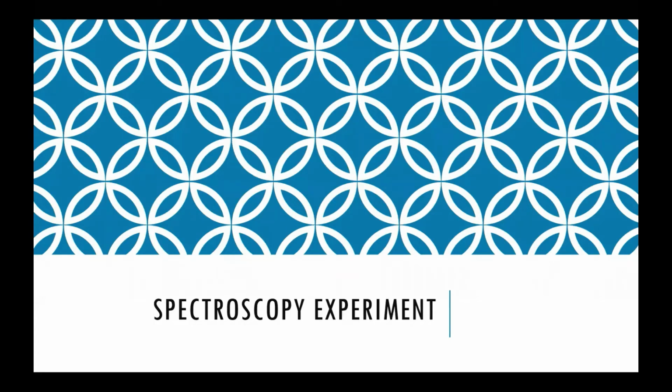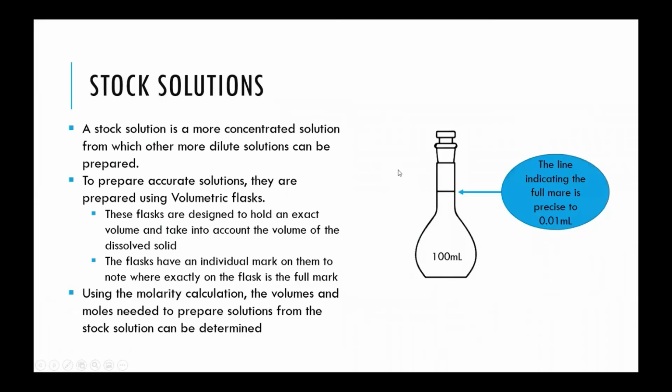In today's experiment, what you'll be doing is obtaining both an absorbance spectrum and a calibration graph of a dye solution. So in the experiment, you're starting with a dye stock solution, and you're going to be preparing a number of different dilutions of this solution using a burette and volumetric flask. A volumetric flask is used to prepare solutions because it contains a very precise final volume. In this case, in the lab, you're using a 100 milliliter volumetric flask.